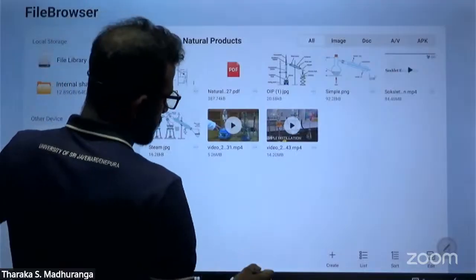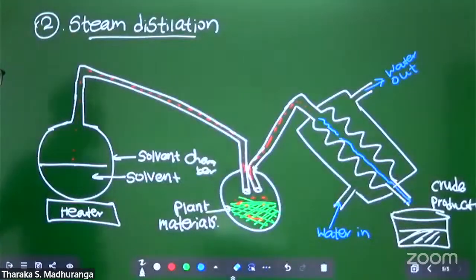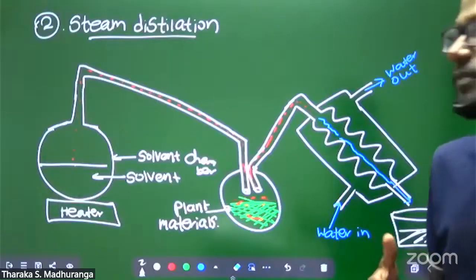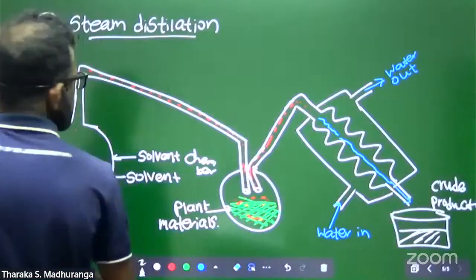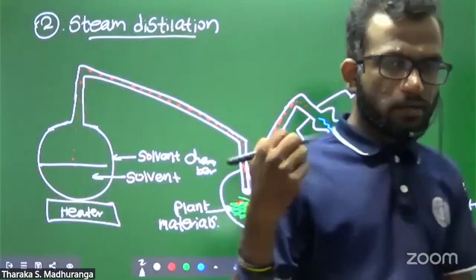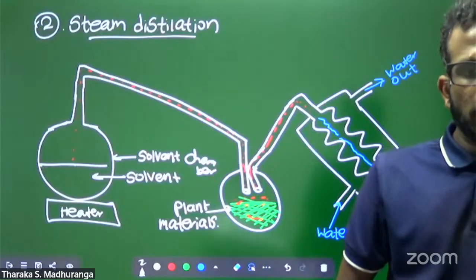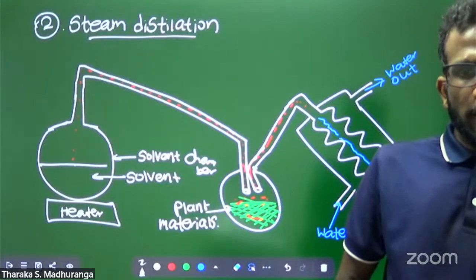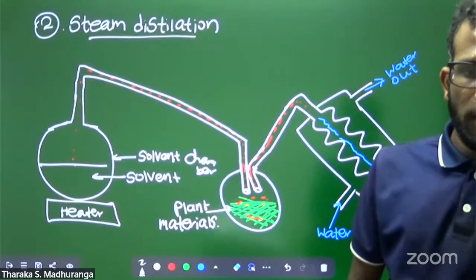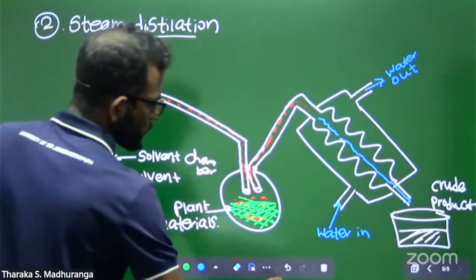Okay, there is the steam distillation process and how steam distillation works. You can search on YouTube or the internet. For steam distillation, a lot of other purposes come in. That's a problem, the extraction is not available. I will find more and I will show you.